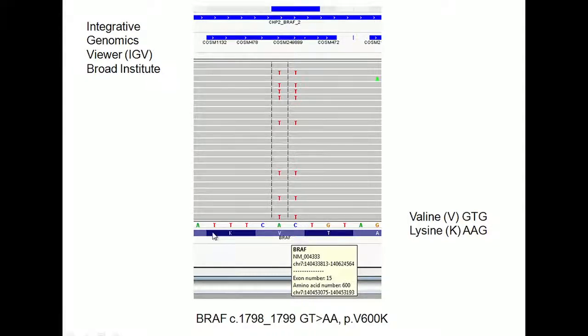So this is the normal human genome, and each of these grayed lines have grayed out the normal parts of the gene. It's all aligned to the human genome, and so the only thing that shows up in this view of the IGV, which is a way for us to visualize it, is anything that's different than normal shows up.